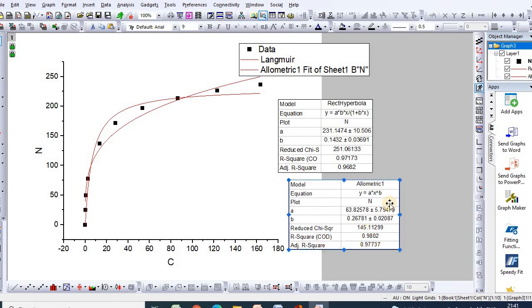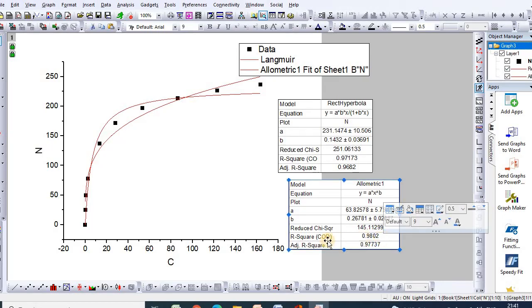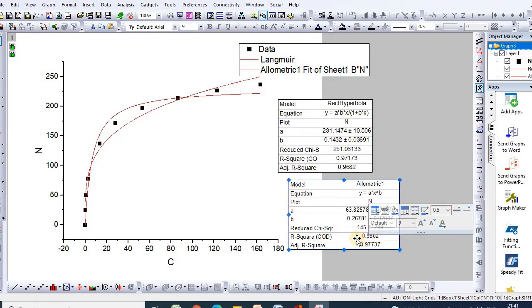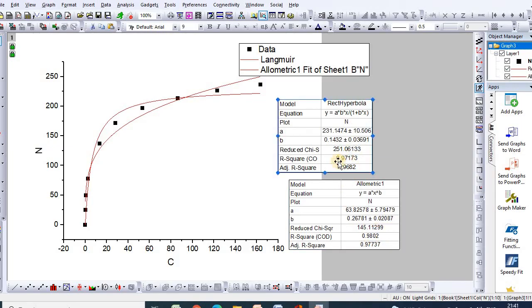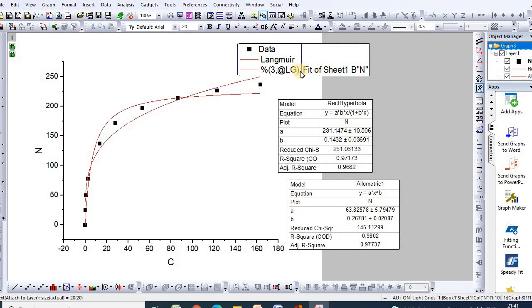Here are your Freundlich isotherm equation parameters. Comparing the two fits, the regression coefficient for the Freundlich equation is 0.98 while it is 0.97 for Langmuir, implying that the Freundlich equation is satisfactorily describing this data. You can also rename it as Freundlich.